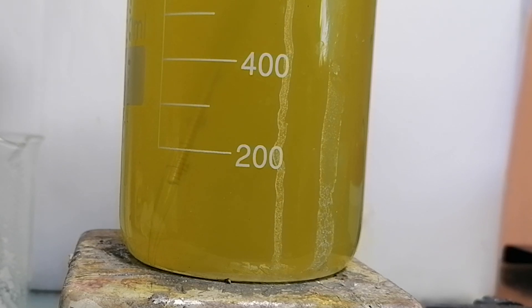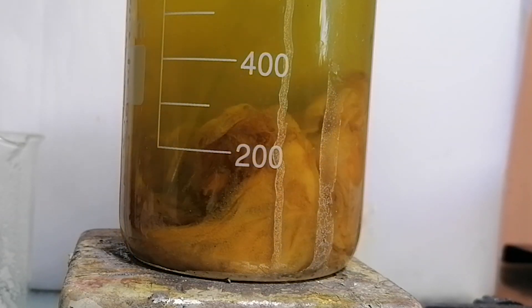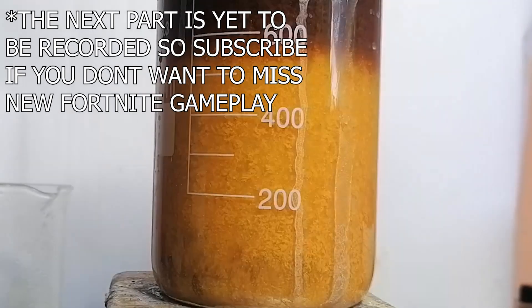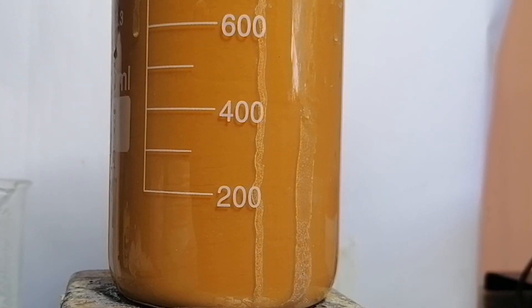So I kind of gave up and added a bunch of sodium hydroxide to precipitate the gold out as gold hydroxide. Anyway, I'll be actually knocking the gold out of the solution in the next part and then I'll be making a cute little orb with it. So for now though, that's everything — see ya.